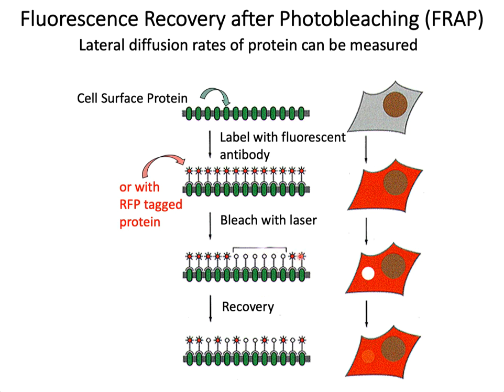You focus the laser light on one small portion of the membrane and you photobleach the fluorophore in that portion. So on the left panel, the fluorophores are no longer in the red asterisk, and on the right panel, it is represented by a white or non-fluorescing spot. And then you allow it to recover; turn off the laser light to that area. If the protein is motile and can move in the plasma membrane, it will move and will fill the area that was photobleached. You can quantitate this and get a real number as data.